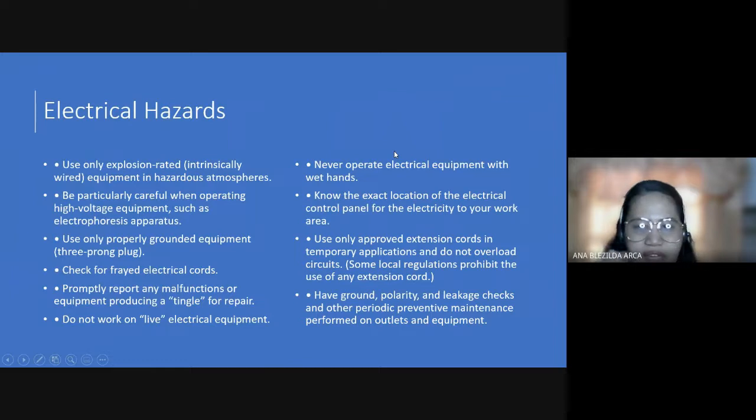Now, let's talk about electrical hazard. Saan ka nagkakaroon ng electrical hazard? Bakit ba nagkakaroon ng electrical hazard? So, this happens if the machine is not properly maintained, di ba? Sabi ko nga last time, mahal. Mahal magpa-maintain ng machine. Ang mga maintenance ng mga machine na yan, pwede silang gumastos ng 50,000 dyan, kada maintenance. So, kung every month ang maintenance, 50,000 per month, di ba?